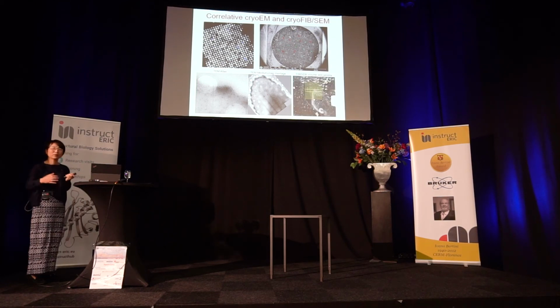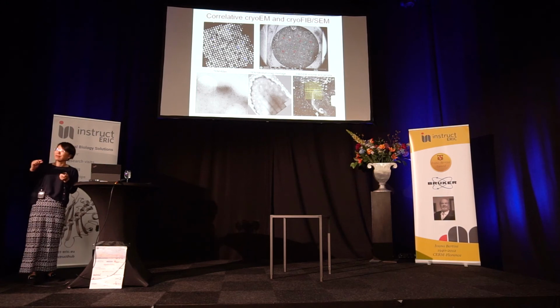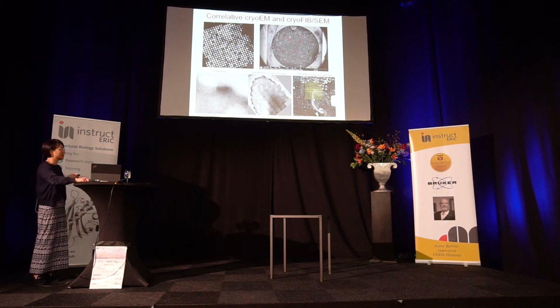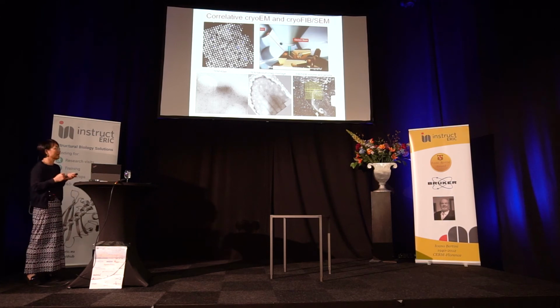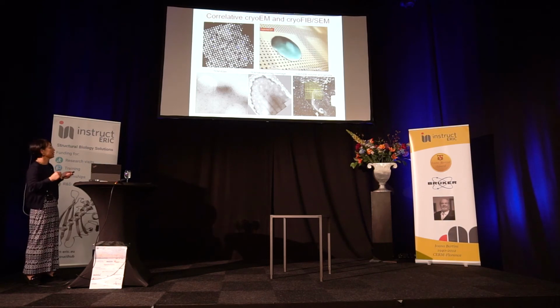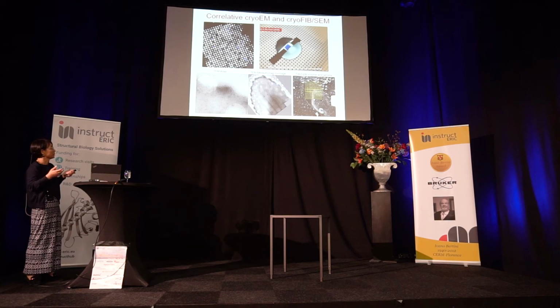Then we do cryo-FIB. We do it two ways. We do cryo-FIB-SEM to do volume imaging of the entire cell for those infected cells. And we also use cryo-FIB to make a very, very thin cell lamella and image the infection process within it. I'll just show a clip taken from an official website of how we do cryo-EM. You see there are two beams, the electron beam and the ion beam, and we place a window around the cell here. The ion beam goes milling away the excess material, and what is left is a very, very thin lamella from the intracellular space.